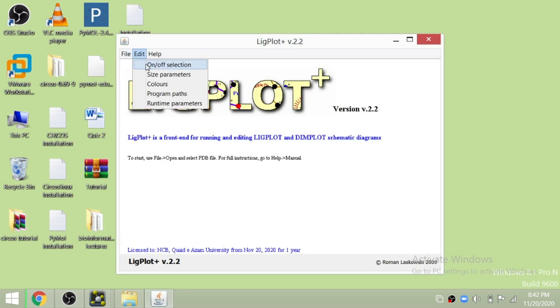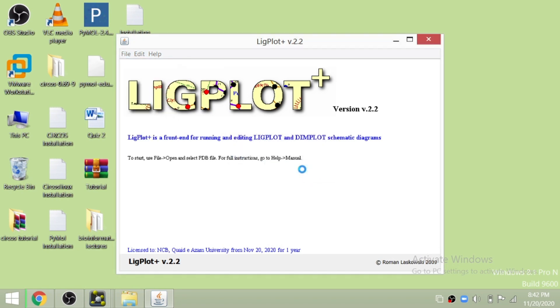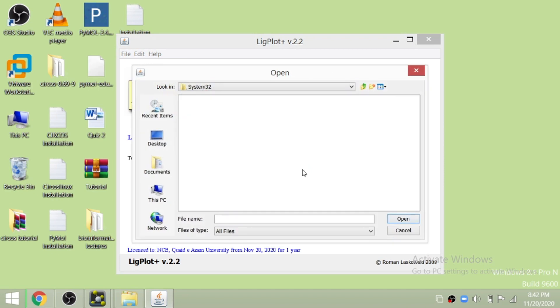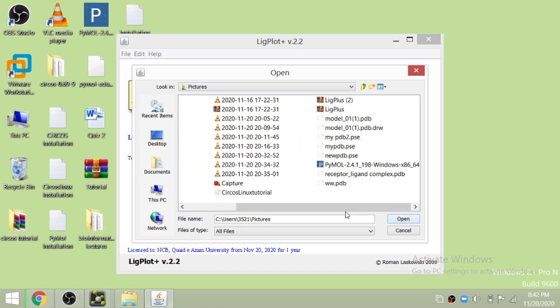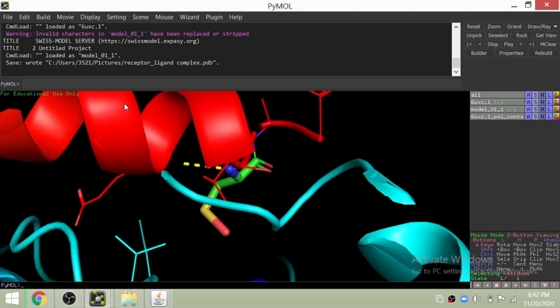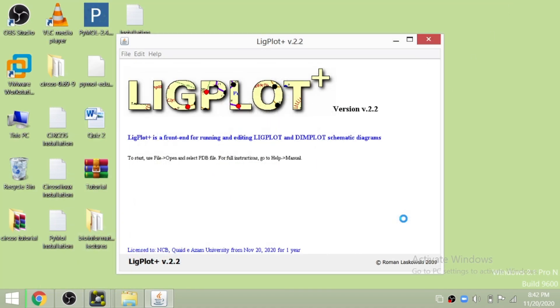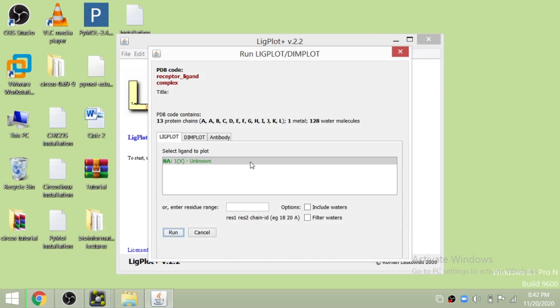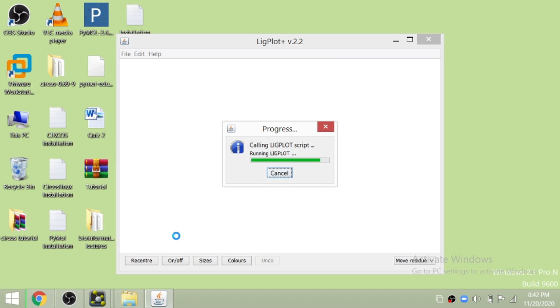Now LigPlot is running. Go to the open option and browse for the PDB file we stored in the pictures folder. Here you can see the receptor-ligand complex file we saved — just click open and it will give us a very beautiful interaction figure. Just click run.